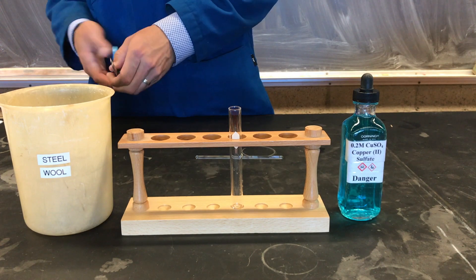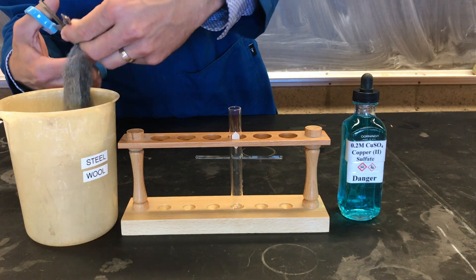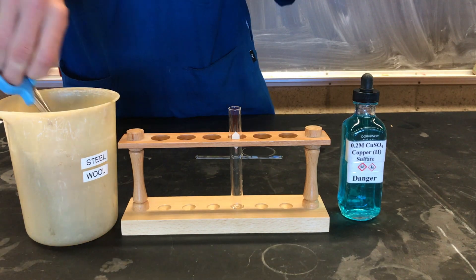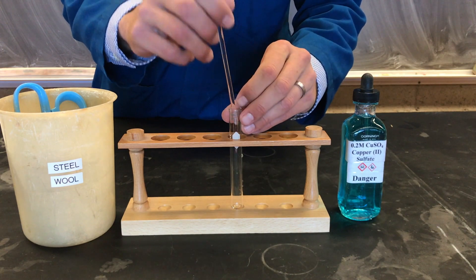In this reaction, we're again using steel wool as solid iron and reacting it with an aqueous solution of copper sulfate. We'll add a small amount of steel wool to a clean test tube.